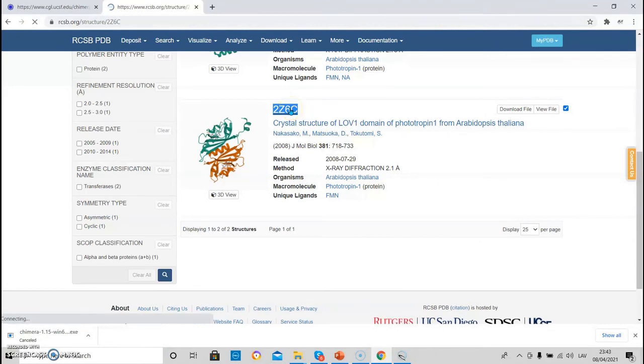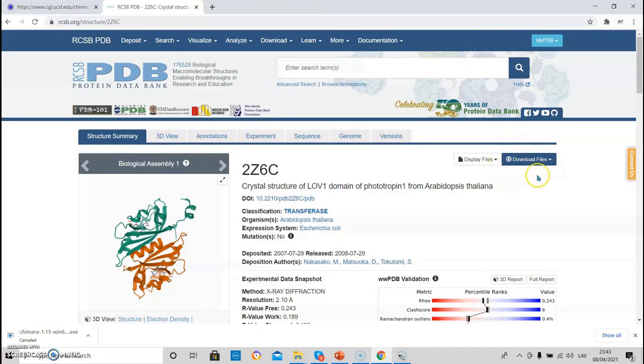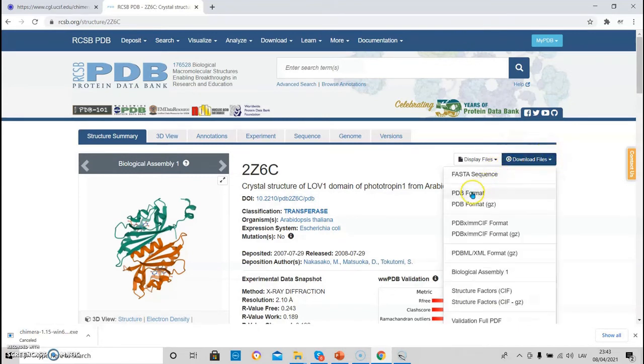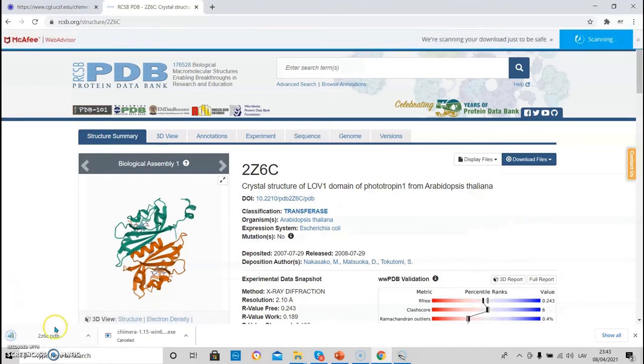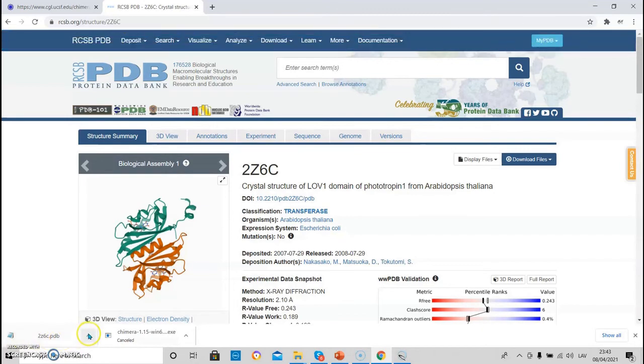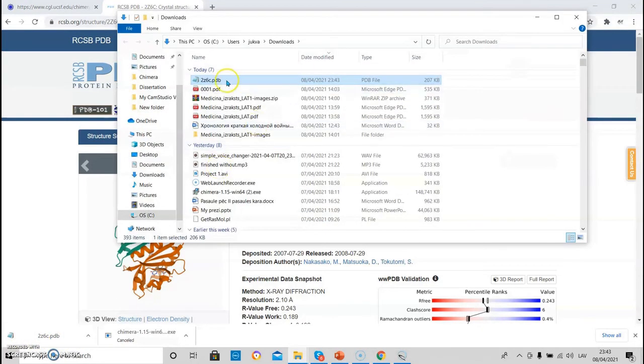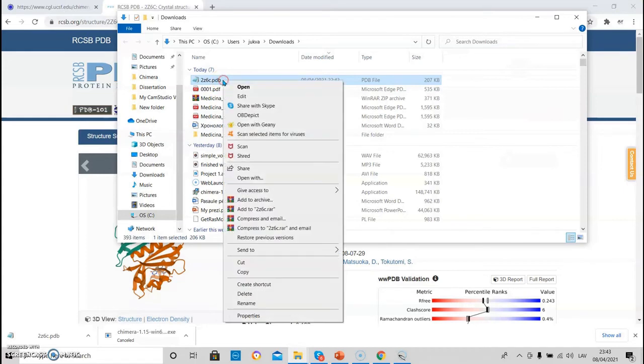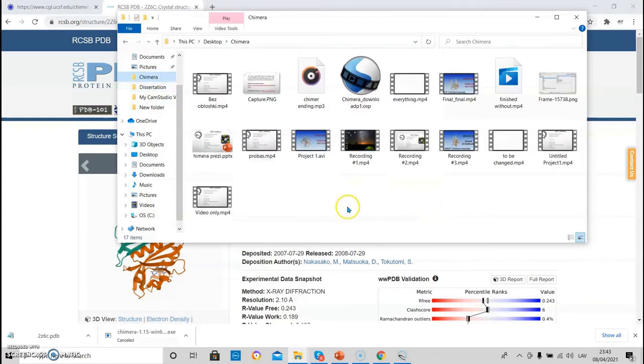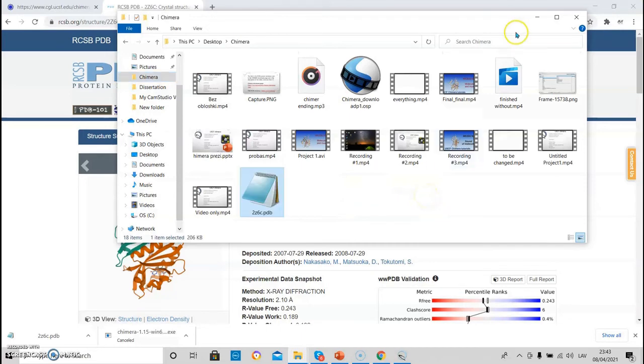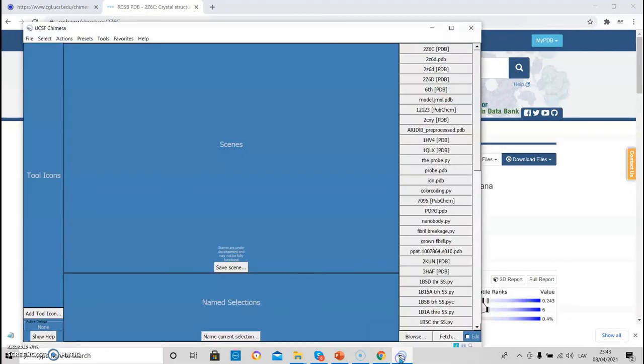For that, you have to go to the page of the PDB structure and click on the download files and choose PDB format. This downloads the structure in the PDB format. And this file, I just transfer it to the place where we can find it.